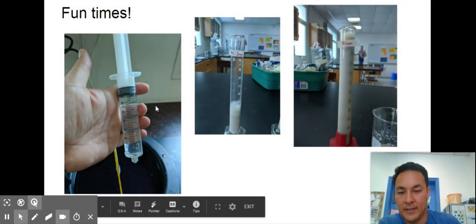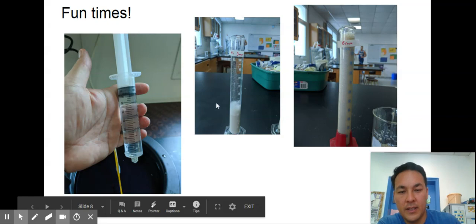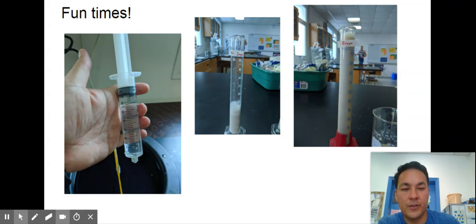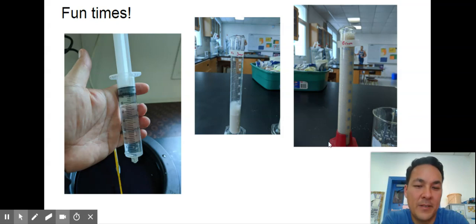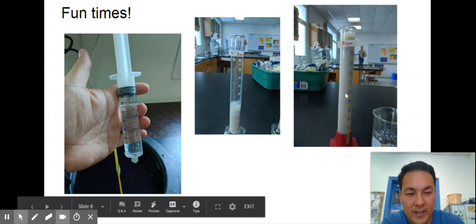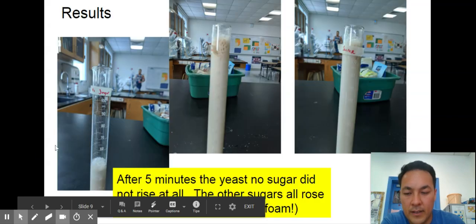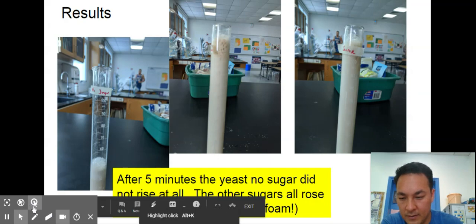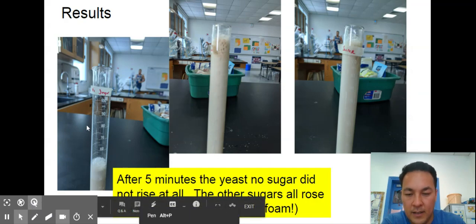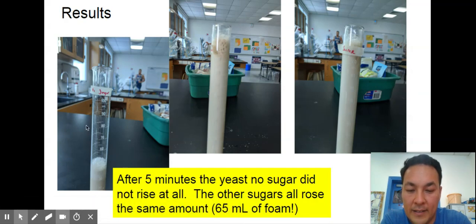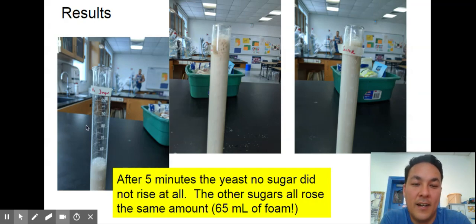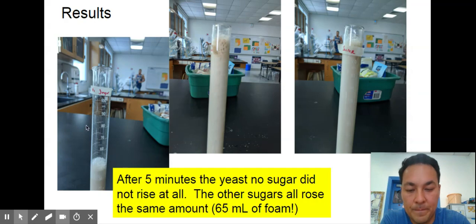Here was my syringe I used to make sure to get the right amount of water. Here is after five minutes — that's how long I let it run. No sugar, and then brown sugar. I was squeezing this in between parent-teacher conferences, so I didn't have the chance to do any stop-motion videos. Here are my results: after five minutes, the yeast with no sugar did not rise at all. The others all took off — the yeast ate up that sugar, produced a lot of carbon dioxide, doing aerobic respiration and then switching over to fermentation. They all rose the same amount: 65 milliliters of foam.